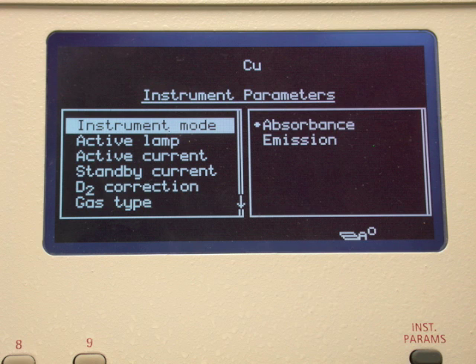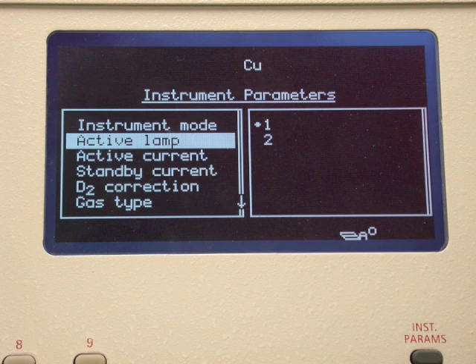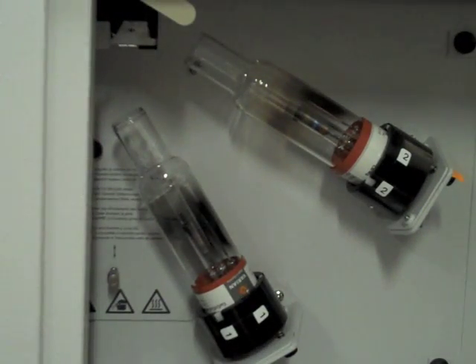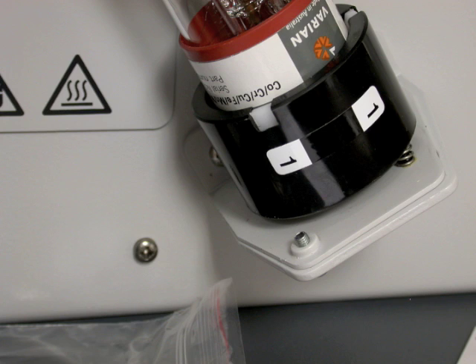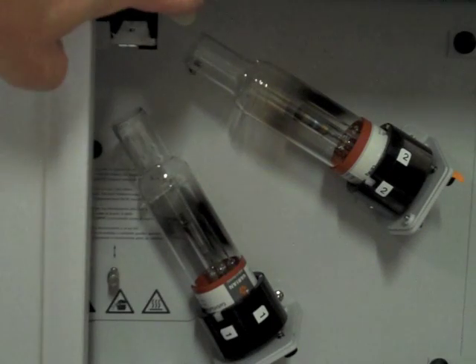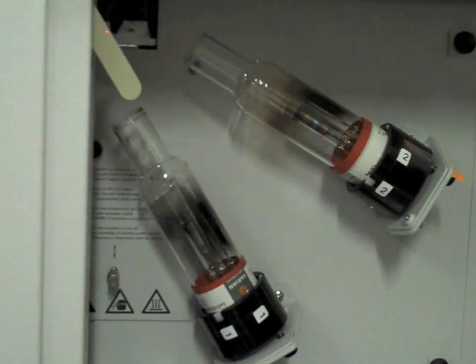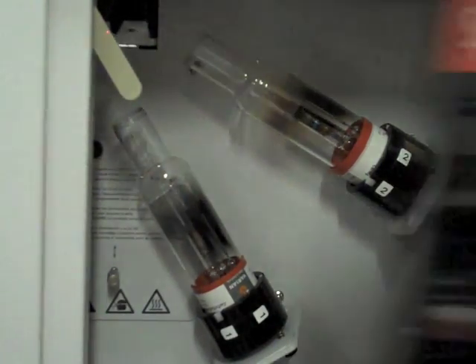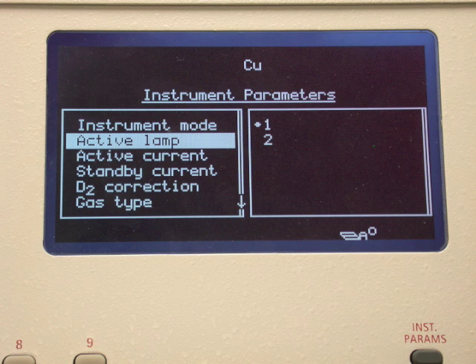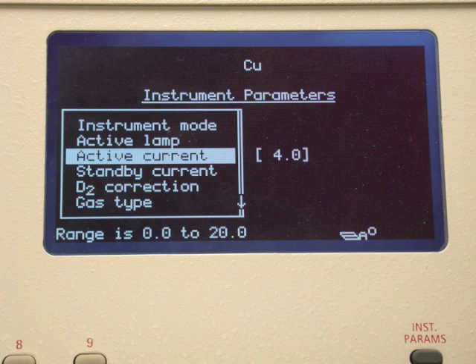This instrument can hold two separate hollow cathode lamps at any time. We need to determine which position the lamp for our element is located. Open the door below the computer screen and look closely at the elements listed on the base of the lamp. In this particular case we have a multi-element lamp that includes copper in position 1. A lever at the top left of this compartment is used to select the active lamp by directing the appropriate light beam to the flame using a mirror. Be sure the lever points to the lamp that you want to use.